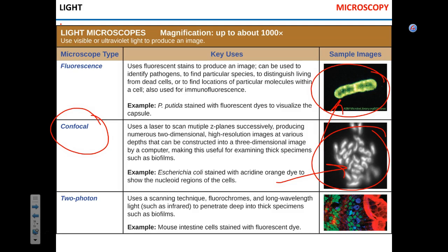That's what we had in Louisiana. You pay, you use it, you get images, you go back. Because the majority of people don't need them every day. Makes sense, right? And finally, if that was Mercedes, this is, I don't know, the Rolls-Royce, Lamborghini of microscopes.